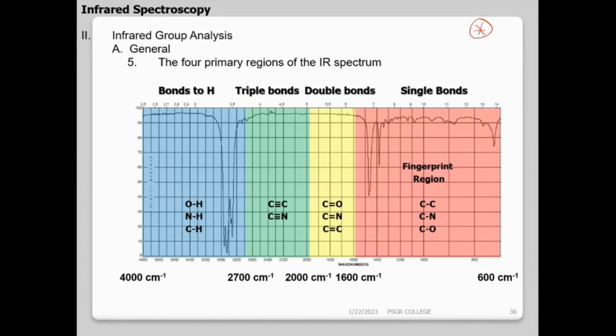இதுல பாத்தீங்கன்னா நம்ம ஏற்கனவே சொன்ன மாதிரி double bond 1600 rangeல வருது. Triple bond is coming in 2200 range. Double bond in 1600, 1700 range. And this too we have seen. And single bond are coming in a lower 1000 range la varudhu.